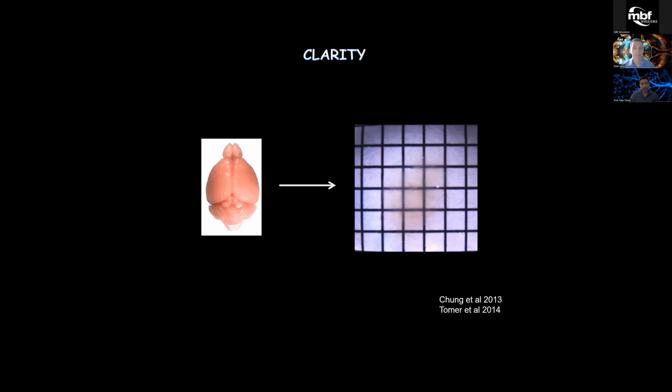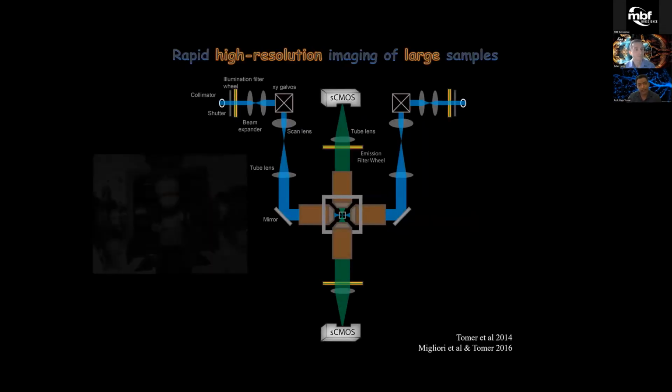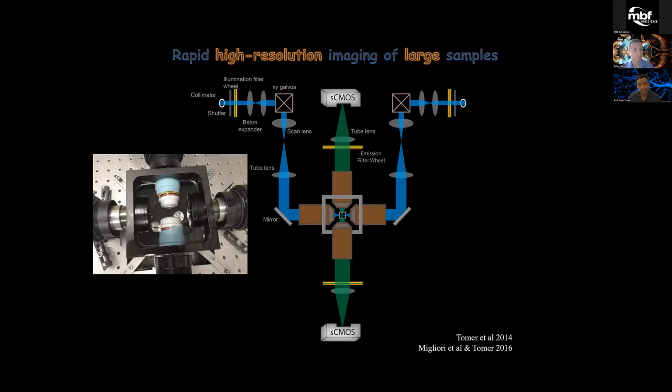So in that context, about a decade ago, we optimized or adopted this light sheet microscopy idea for high resolution imaging of such large, clear, transparent samples.